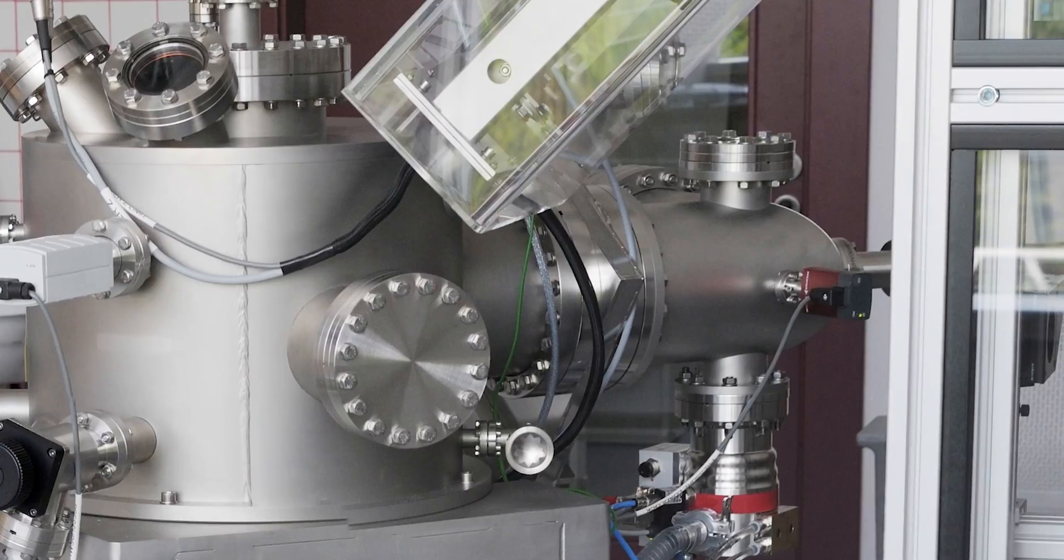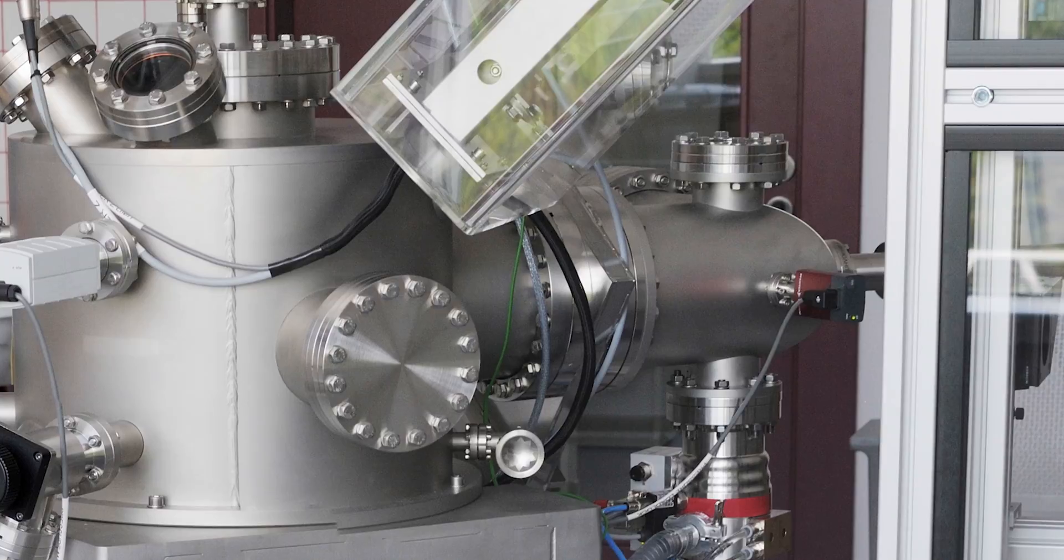Lithium phosphorus oxynitride, or lipon, is a candidate material that may enable this. But in order to fabricate these lipon films, we tend to use atomic layer deposition. In order to tune the electrical properties of these lipon films, we try and modify the elemental concentrations or the chemical bonding of those elements.